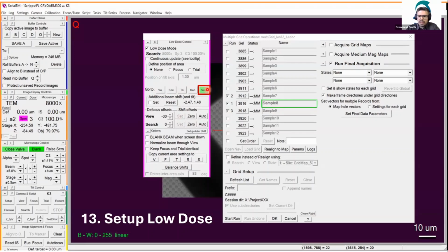So in search, we pick a magnification in the mag range that has a larger field of view. But since we've skipped the steps for realignment that jump into the low mag and realign to atlas, we prefer to stay in the high mag range and realign to square maps. So we've introduced a script that when any new grid gets reinserted, it's going to go to search and it's going to take a square montage over a square, and it's going to align that square montage over the single square image, calculate the offset, and then it will readjust all your coordinate points based on that offset. So that way we can compensate for that 2 micron offset between grid reinsertions.